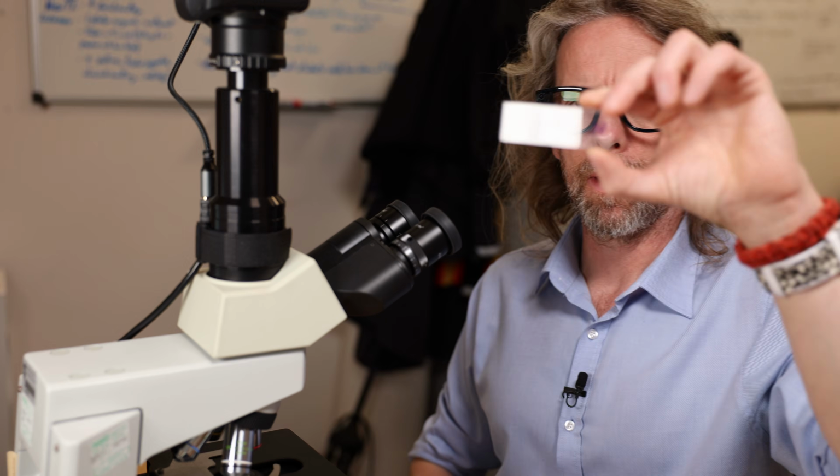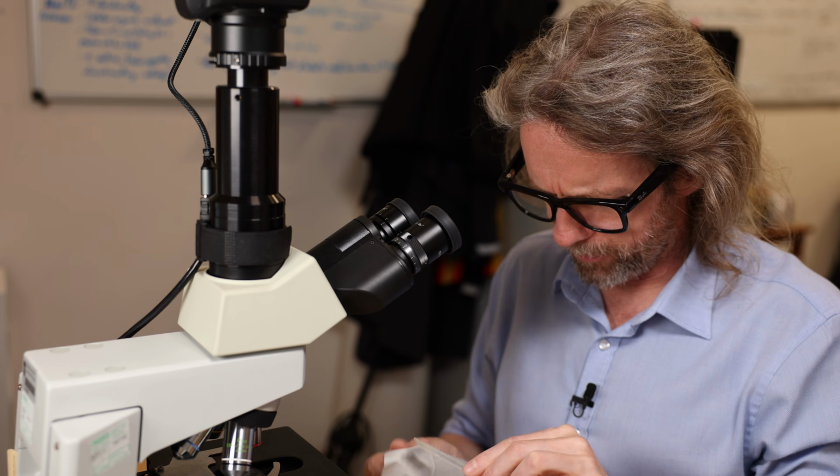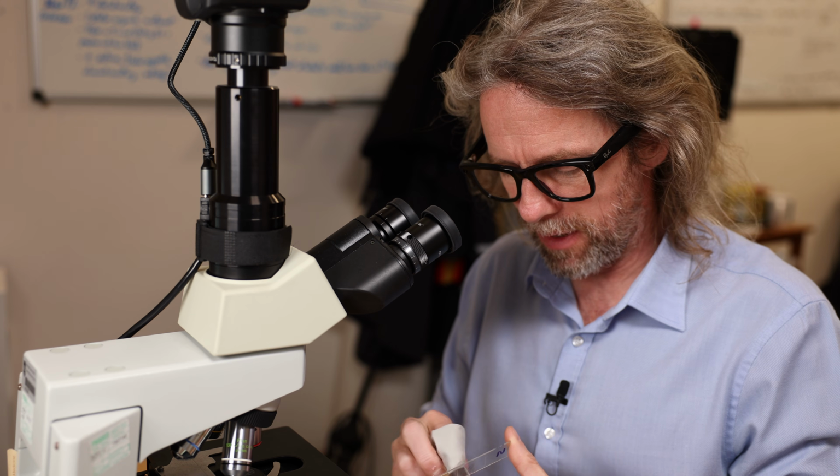Okay then, this is a piece of sciatic nerve. I don't know from which animal. So the sciatic nerve is the biggest nerve in the human body, right? It's a really, really big nerve.